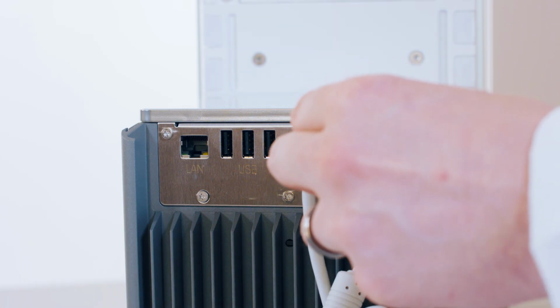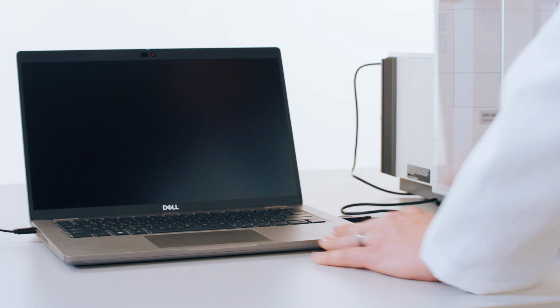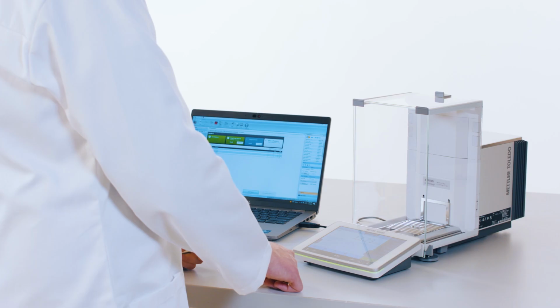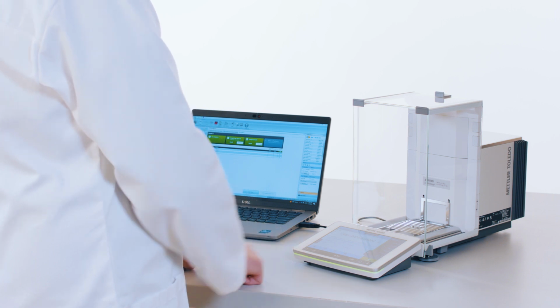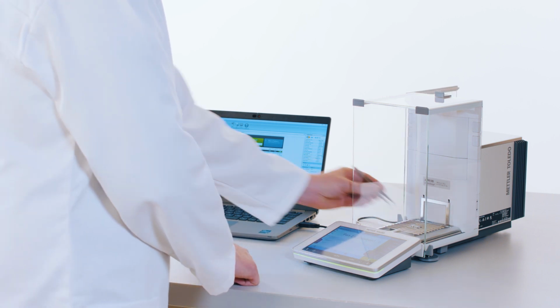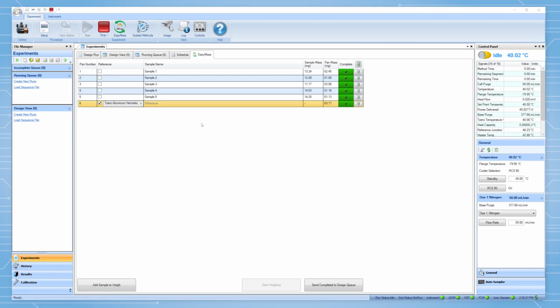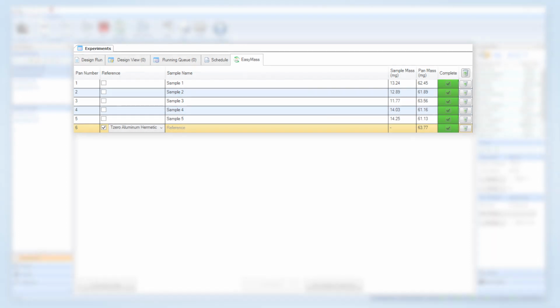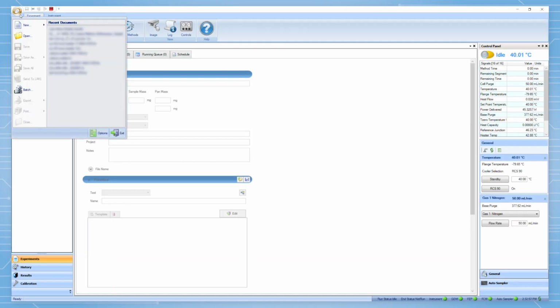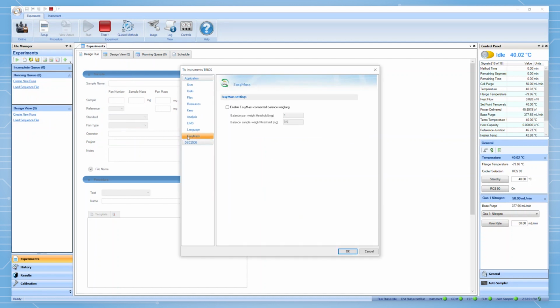A balance is connected to the computer by a USB cable, and on-screen instructions guide users through the sample weighing process. With the press of a button on the balance, mass values are transferred and stored in TRIOS. This is repeated at the balance for the entire sequence of samples to be weighed. When you step back to TRIOS to finish experiment setup, you will already have an entire table of masses ready to go. To start using EasyMass, make sure you have the latest version of TRIOS and that the EasyMass feature is enabled in TRIOS options.